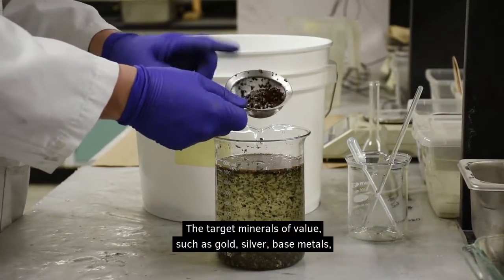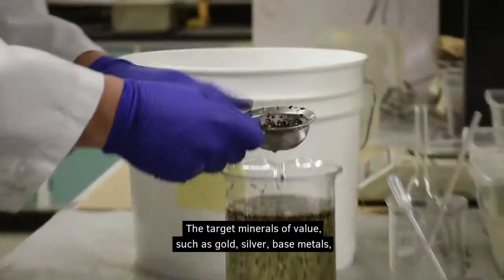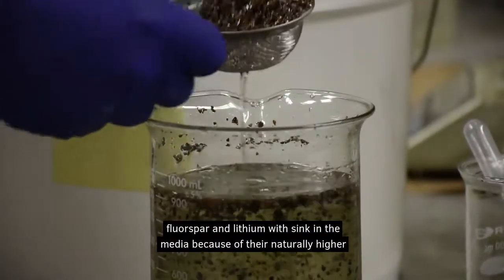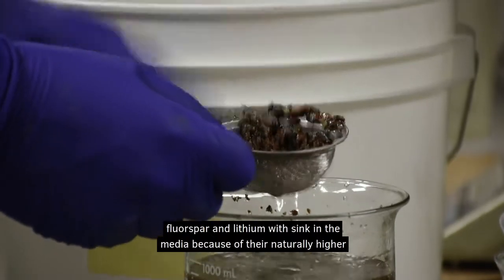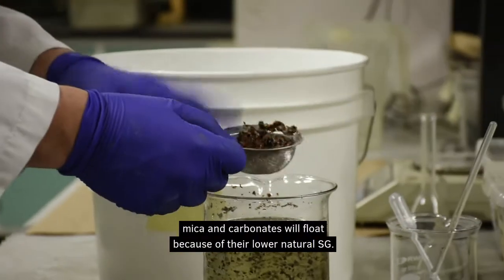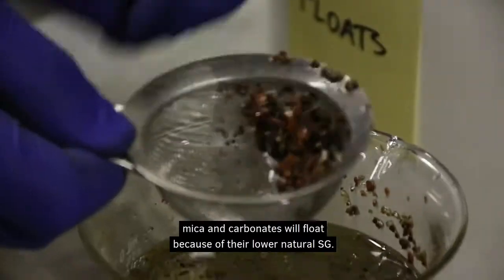The target minerals of value — such as gold, silver, base metals, tin, tungsten, fluorspar, and lithium — will sink in the media because of their naturally higher SG, while the gangue minerals, such as quartz, mica, and carbonates, will float because of their lower natural SG.